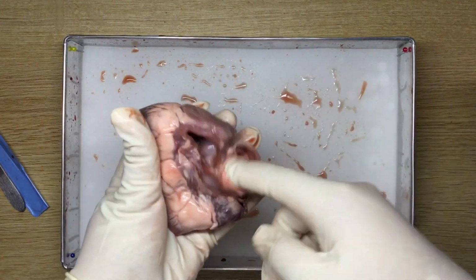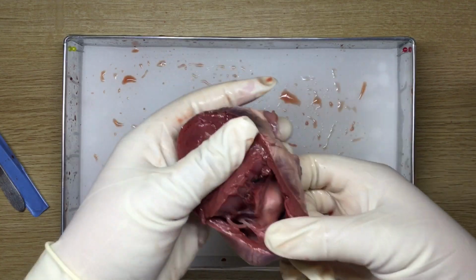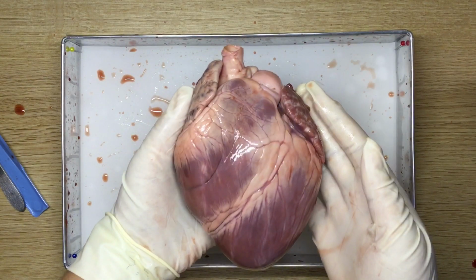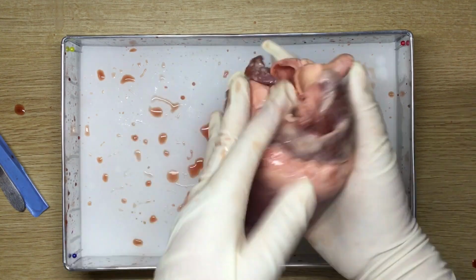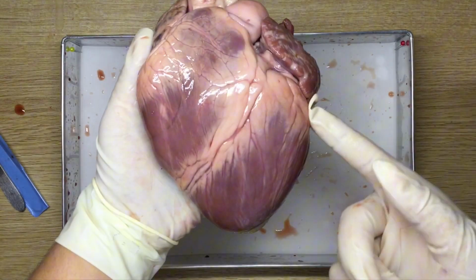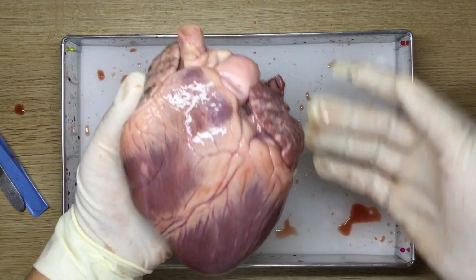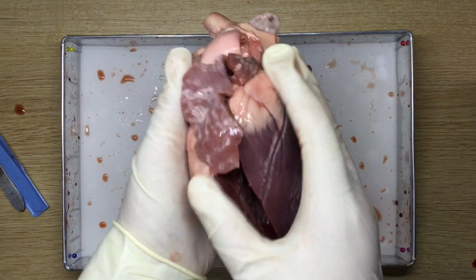While the left ventricle has a much thicker wall to generate high pressure, allowing it to pump blood throughout the entire body. These are the parts where we can see the right and left ventricles together with the right and left atrium. This is the sagittal cut of the heart.